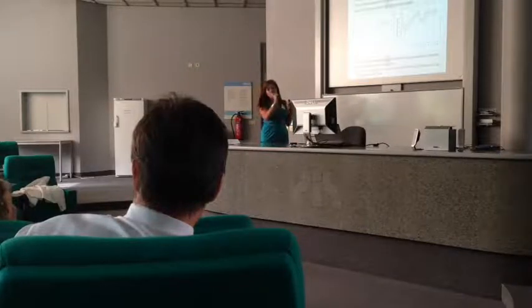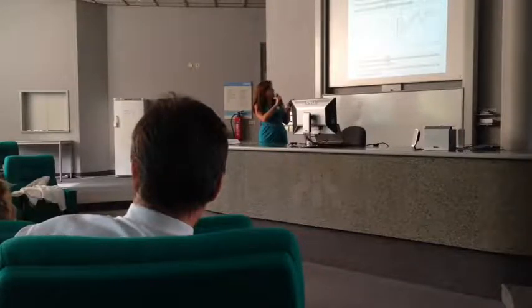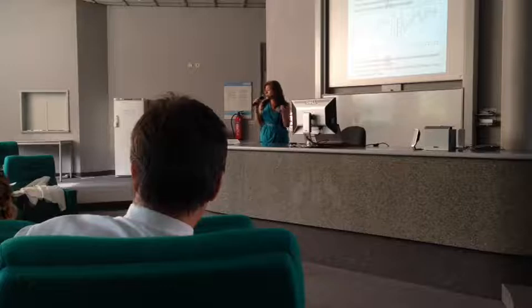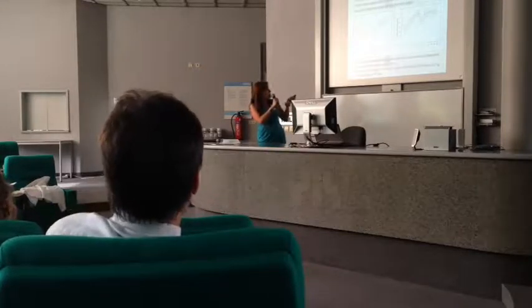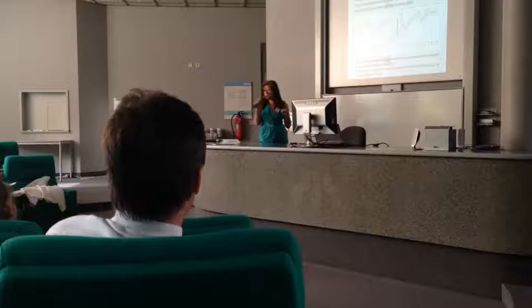And this is where we focus on the photophysiological response. We can see that Fv/Fm dropped dramatically after inoculation, which is related to the adaptation of the culture to the high light, and usually the response looks like this. And when nutrients start to become limited, the physiological response quickly shows that the culture needs some changes and adaptation to these conditions, and it improves after nutrients come back into balance.